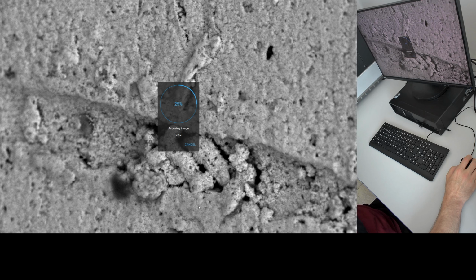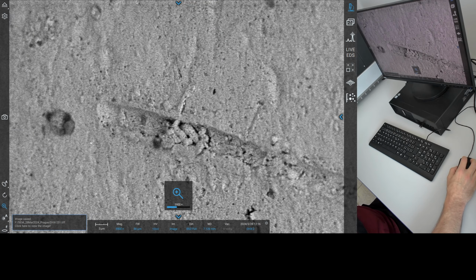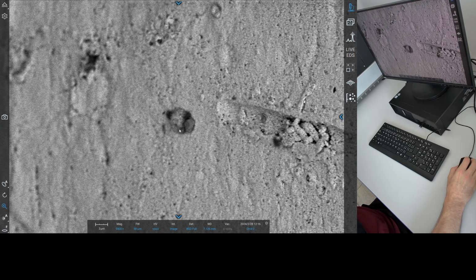Just beautiful. Is there any doubt? On this machine because the EDS is not working today, we focus on geometry, and that's not such a bad thing. Look at that. All right, we'll go down and we'll look at this one with the same detector.